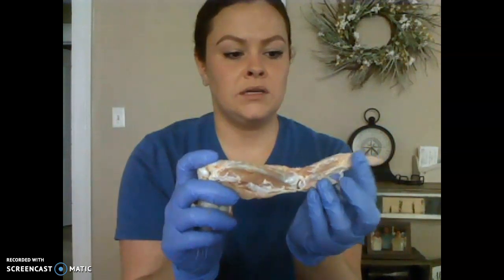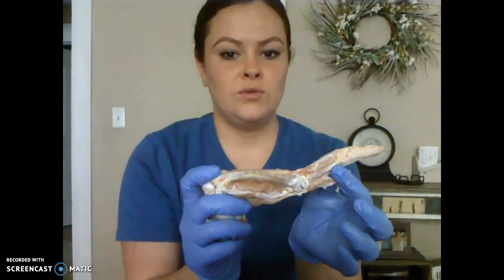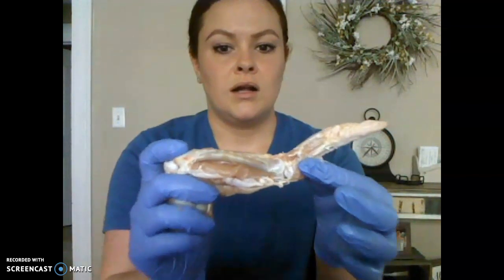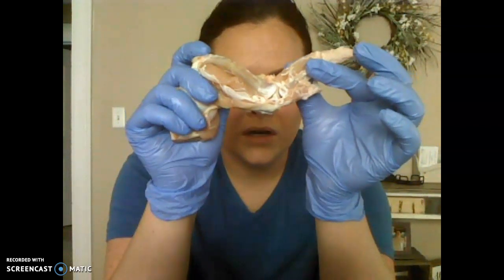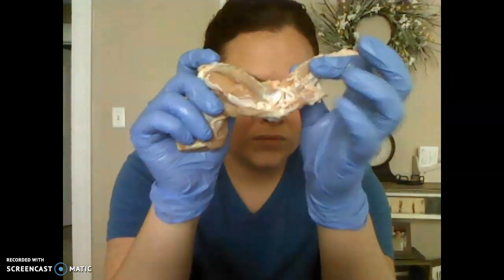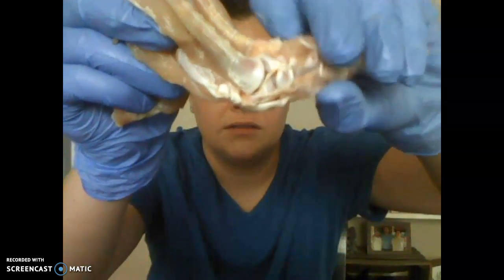So you can see this is a bone, and this is a bone, and in between those you have your synovial joint right here. So when I pulled these apart, you can see the white that's in between the ends of the bones. That's your articular cartilage right there. Is a good shot.